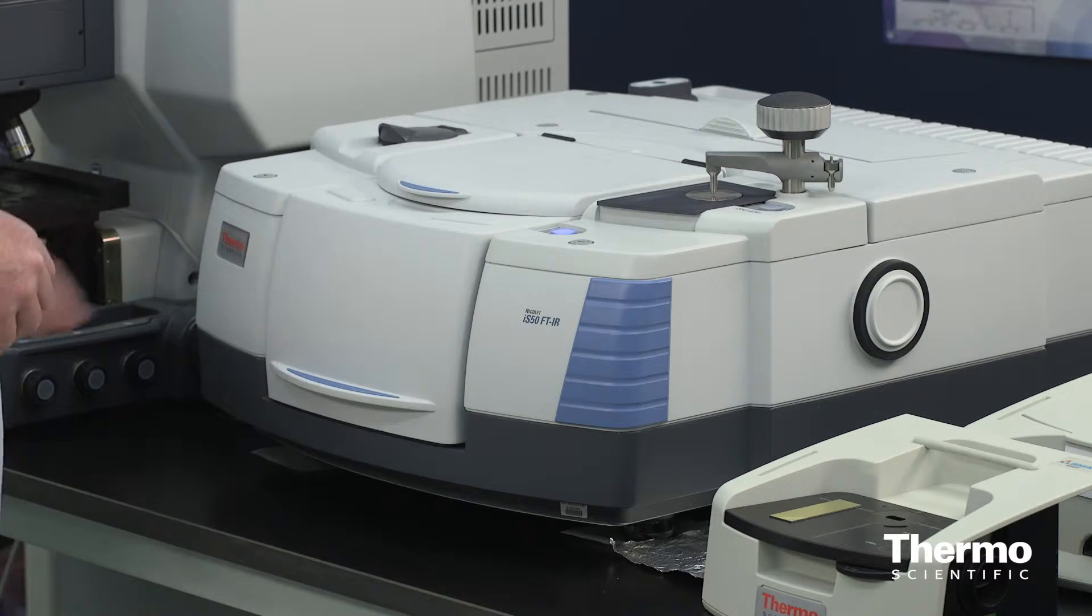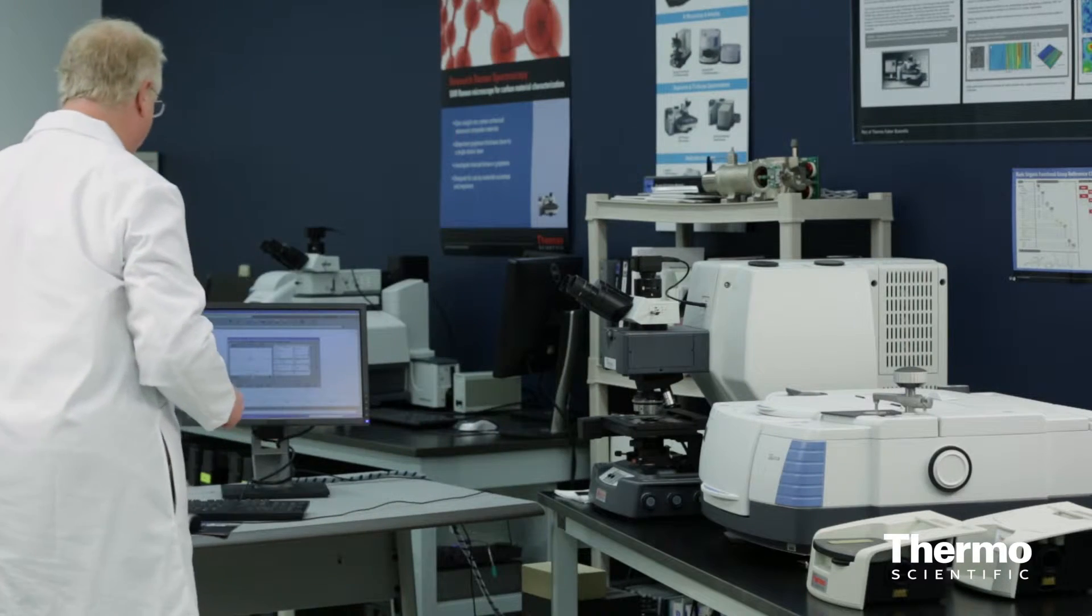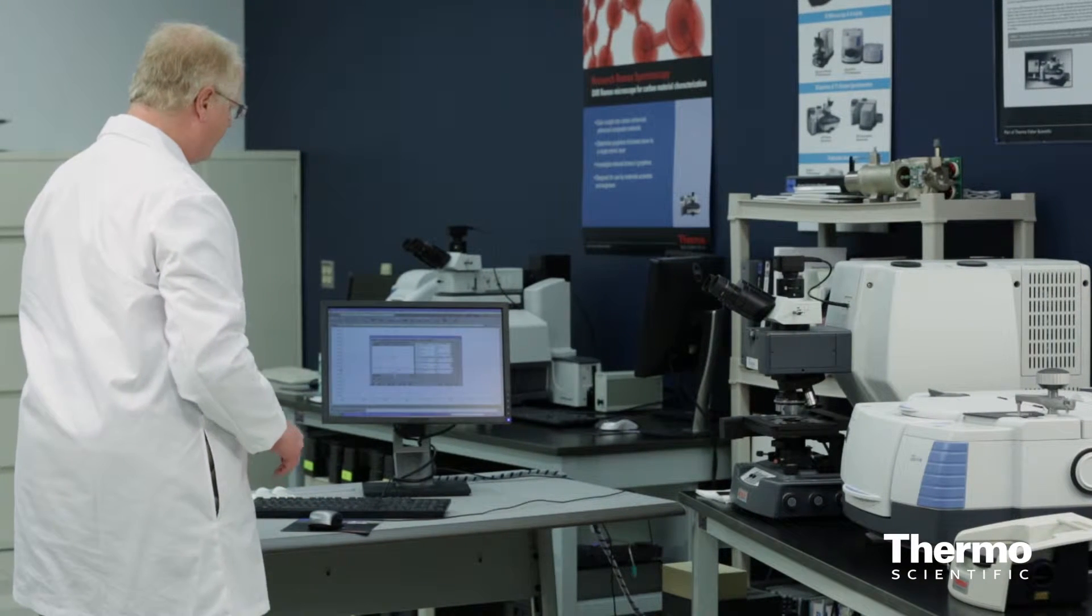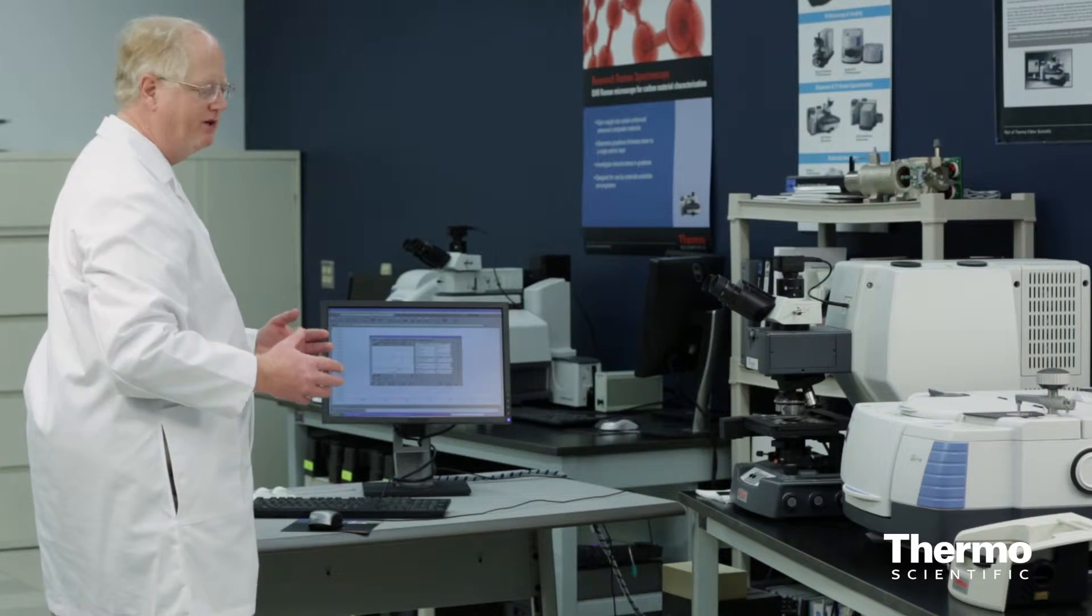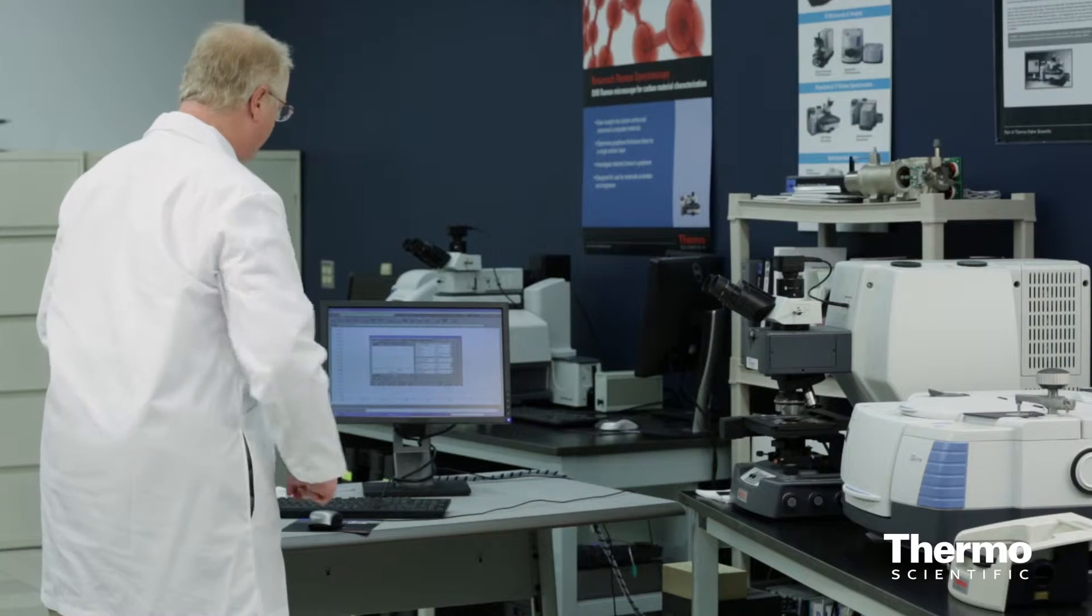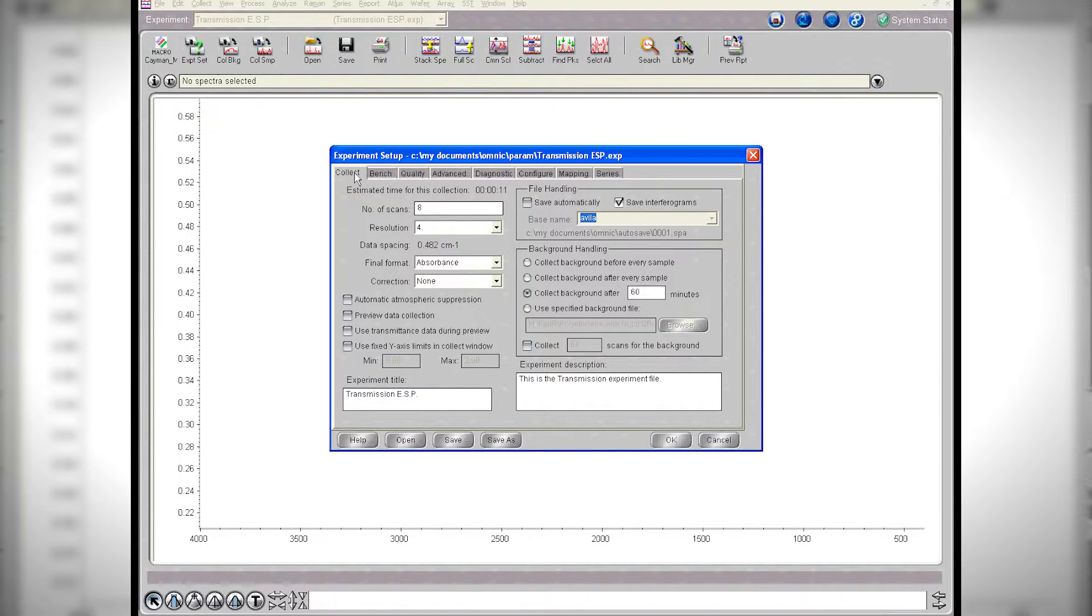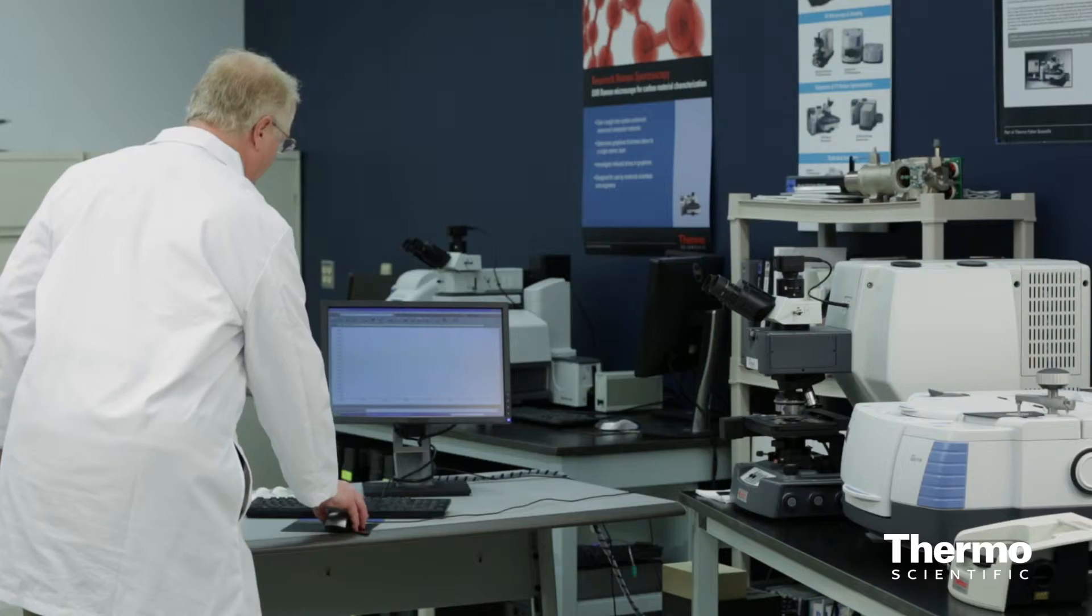Moving over to the computer, let's look at the settings. I've got this set up for a moderate resolution type of experiment for wave number resolution using the DTGS detector, the standard range. I'm going to collect eight scans—that'll be plenty to get me where I want to go.